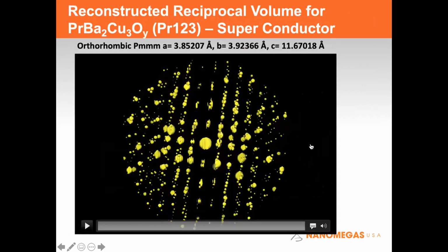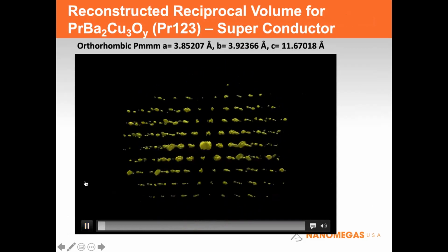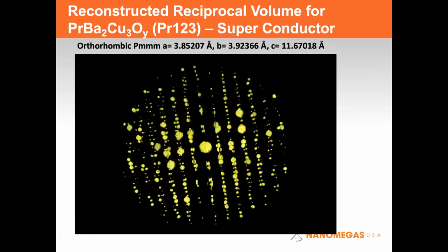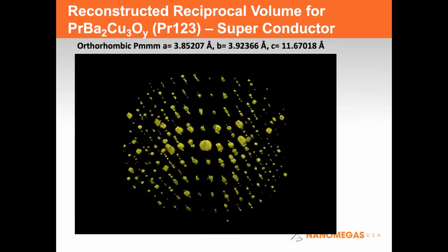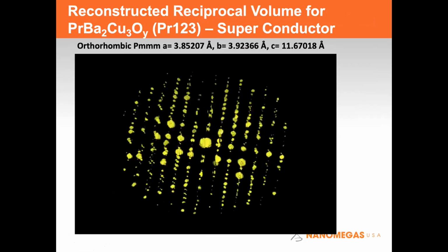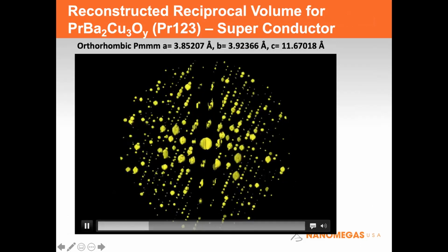And then this is just a nice visual to show you what's possible. We're all used to looking at diffraction patterns in this way, but with this superconductive material, you'll see that you actually have a 3D volume of reciprocal information, which allows you to solve structures ab initio. So this is single particle work, where before you're mapping multiple particles. This is just trying to solve a particular material.